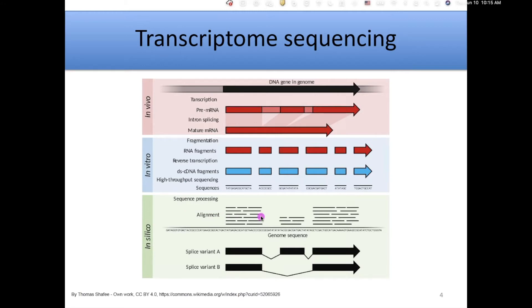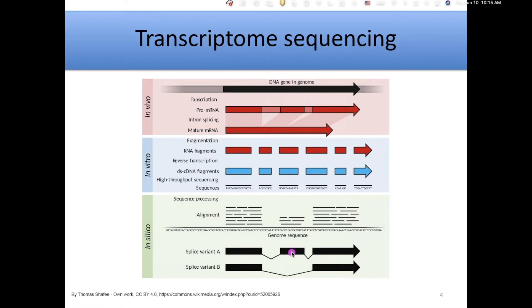We process those reads by aligning them to a genome. In this diagram, the reference genome is along the bottom and the black bars represent where reads are aligned. You can use that information to rebuild information about the genes — you can see where reads align corresponds to where the exons are. You can also see that for the middle exon, the number of reads that align is lower, meaning you can infer that sometimes that exon is included in the mature mRNA and sometimes it's not, allowing you to look at alternative splicing.